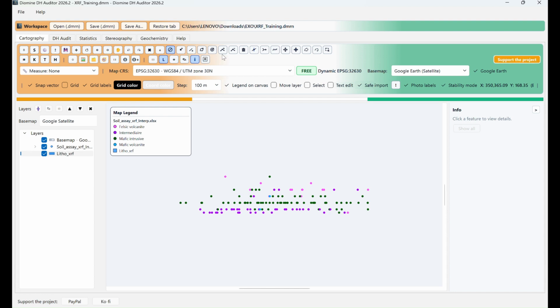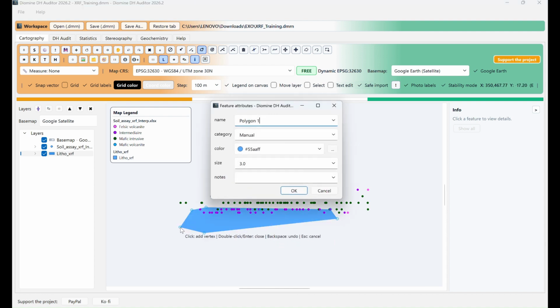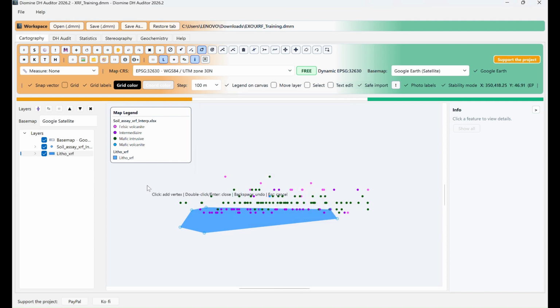This is the way we need to do. So okay, you're gonna do it like that. Finish. I'm gonna call it maybe granular direct. And then I'll right here.